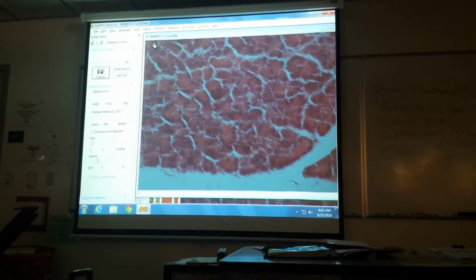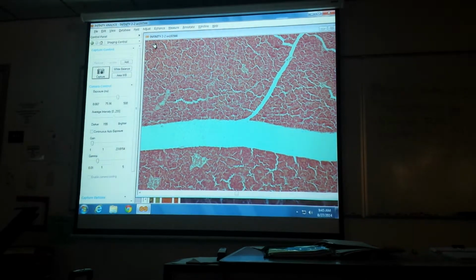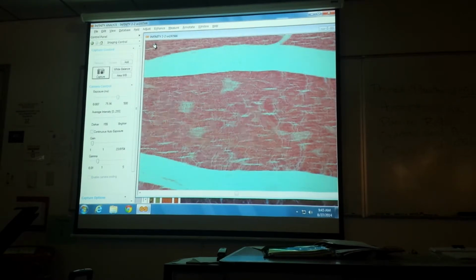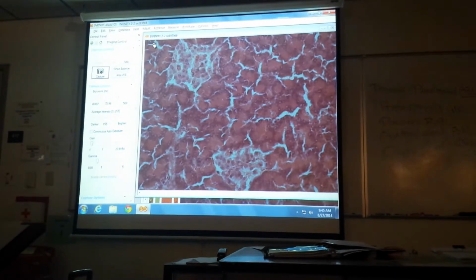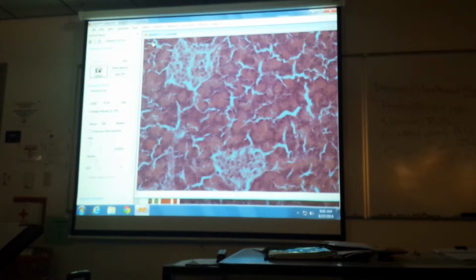So usually what I do is I start on low mag so I can scan around more. I see a big one on the bottom. See these big two? There's 3 or 4 of them there. Let me try to get one of those in the high mag. Pretty good. Okay, I'll take a picture of those two.